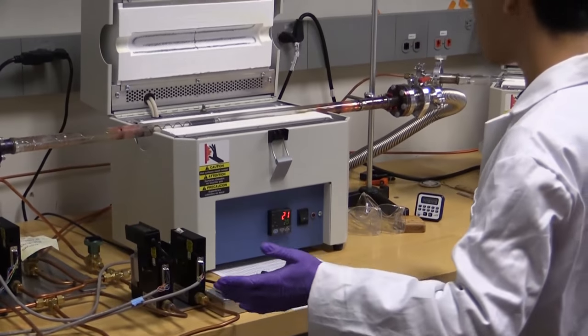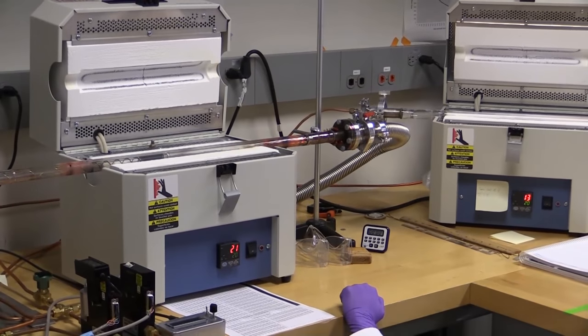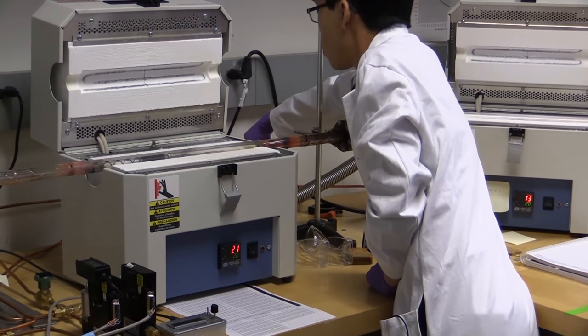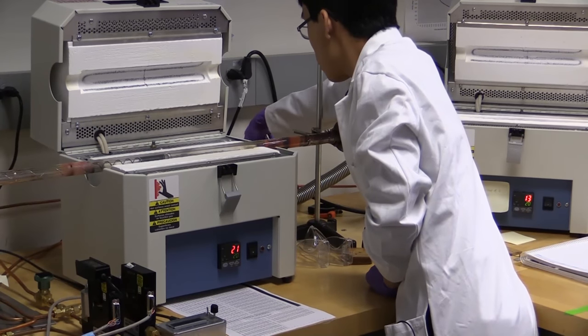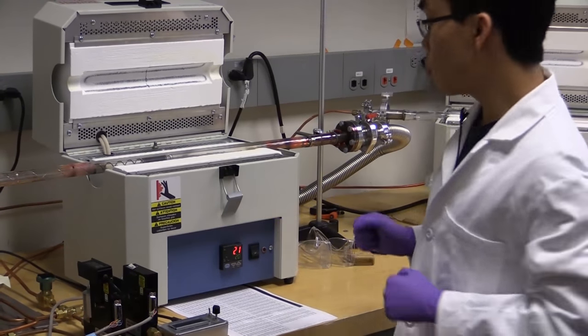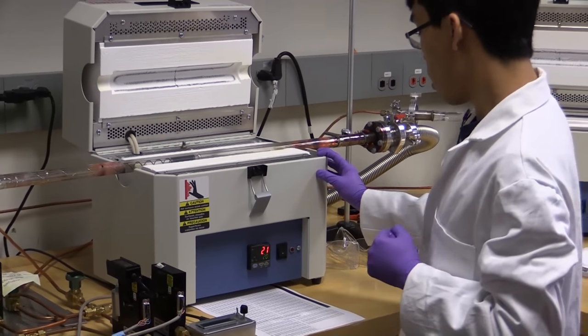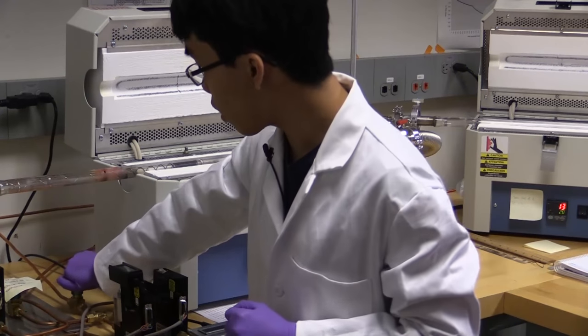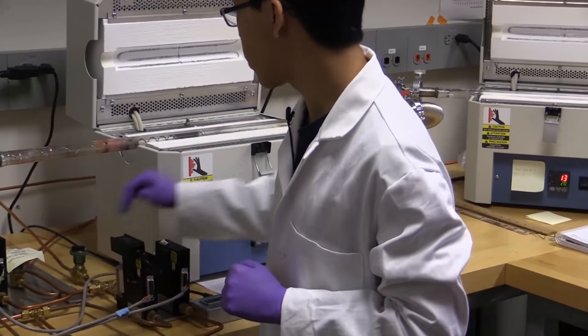Once that's together, I'll go ahead and turn on the vacuum down here. A bit loud. And open this valve. Our pump should take our system below one millitorr, or one millionth of an atmosphere. Once that's done, I'll go ahead and pump down part of our gas system with this valve.